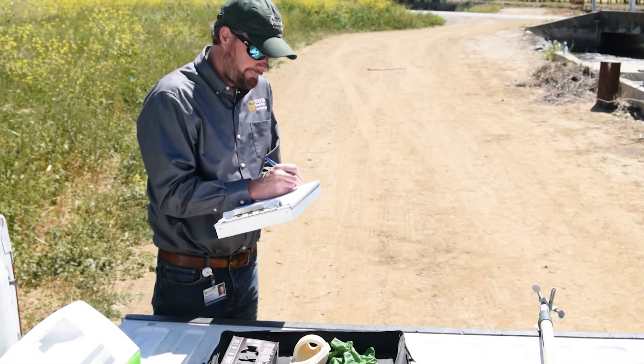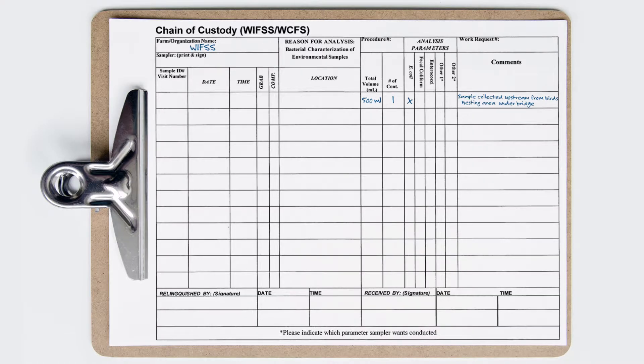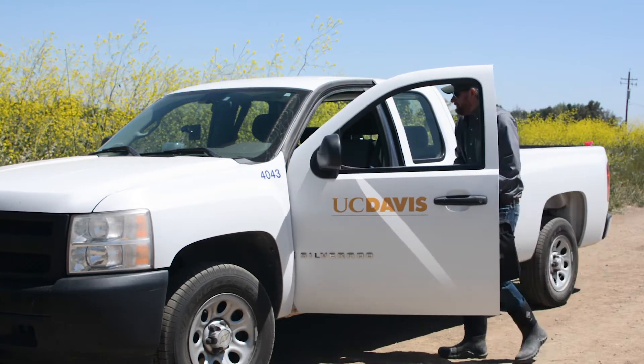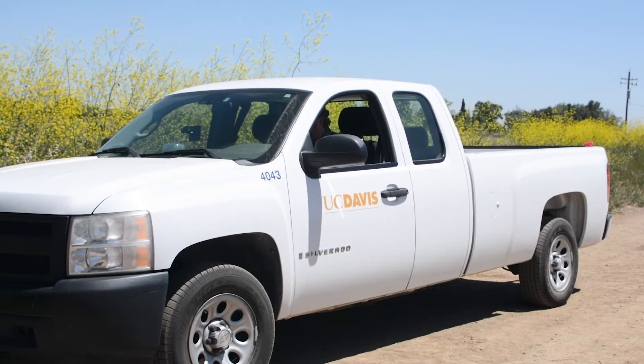Complete all fields of the chain of custody form. Include the name of the person who collected the sample, the sample ID number, date and time, type of sample collected, and the sample location including GPS coordinates. This document tracks the movement of the sample from the time of collection until it arrives at the lab.